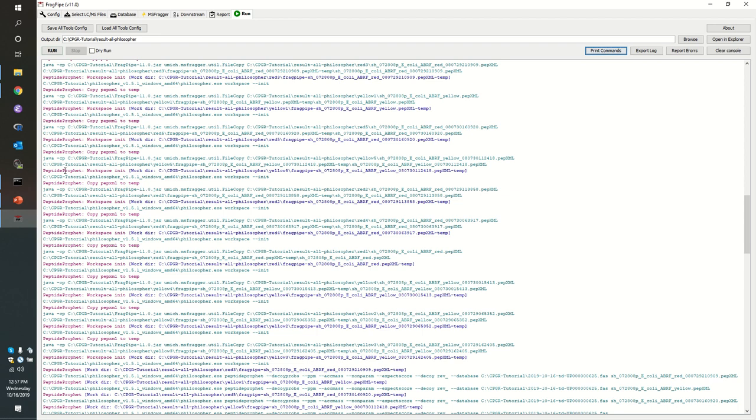You've already seen something like PeptideProphet running. You remember when we looked at idpicker and we slurped up all of those pepxml files. In this case, PeptideProphet is going to do something rather more complex in order to assess the quality of each PSM. The target decoy method that idpicker uses is all about aggregate error. But idpicker is not going to tell you which PSMs are doubtful and which ones are great.